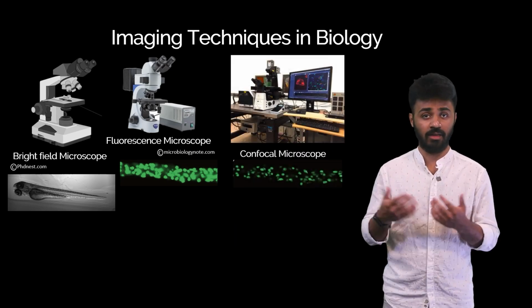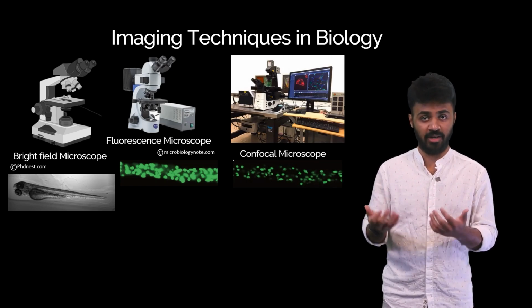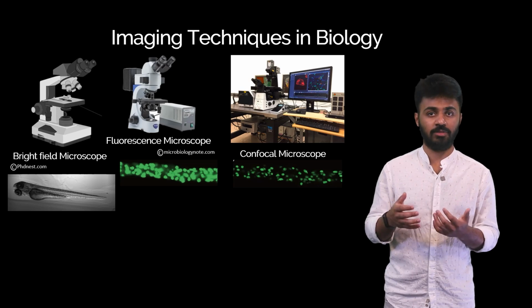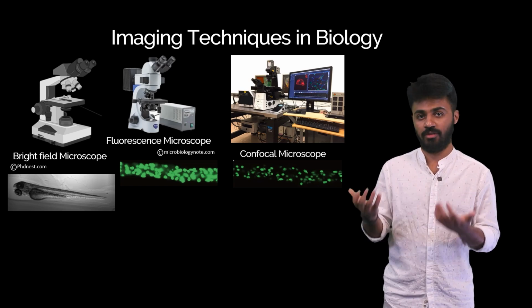Confocal microscopy is a technique that uses a laser to illuminate the sample at a specific depth. The microscope then captures the emitted light only from the specific plane, allowing for a 3D reconstruction of the sample.